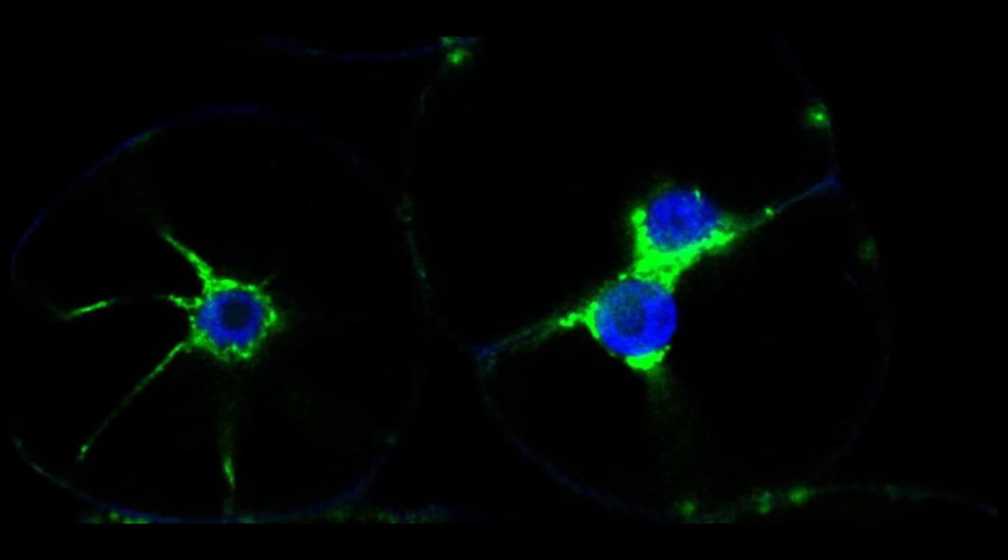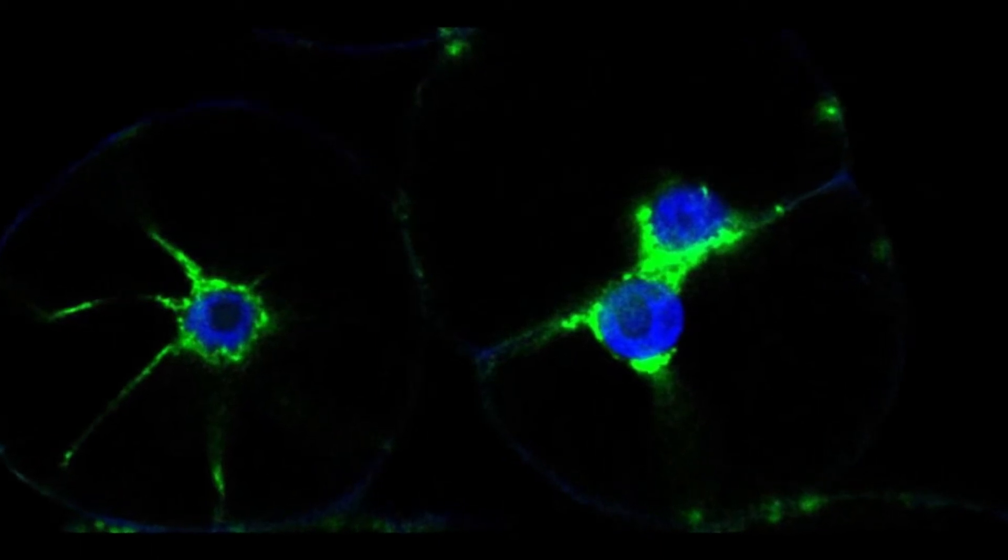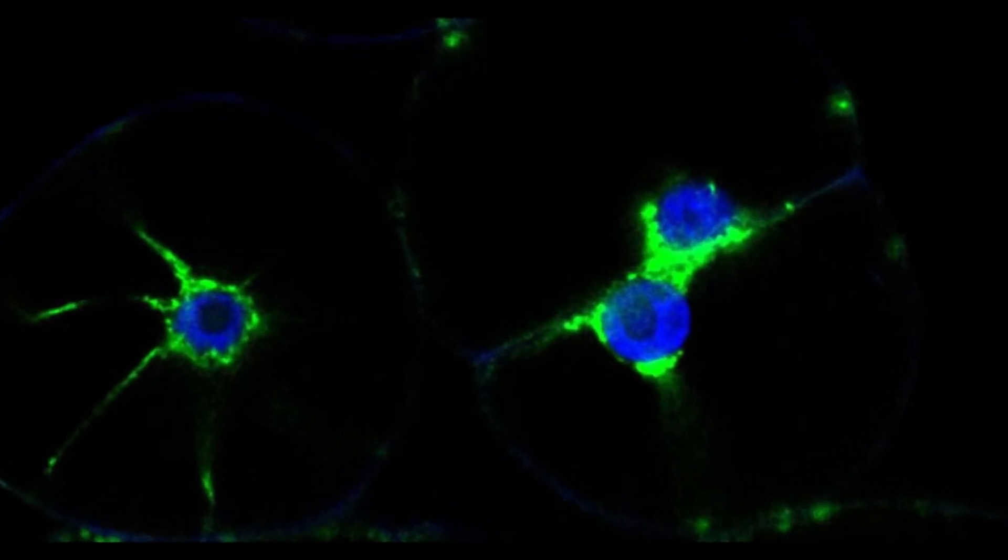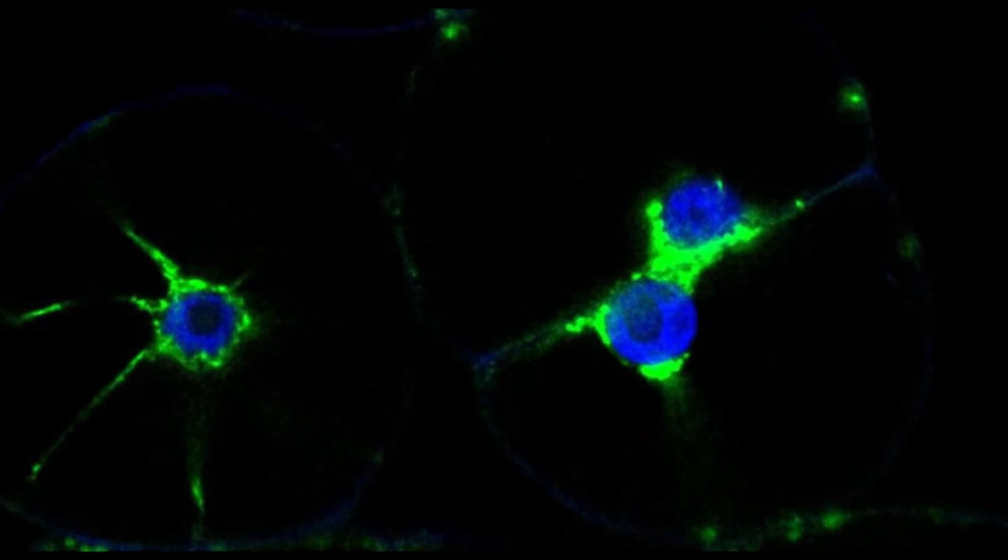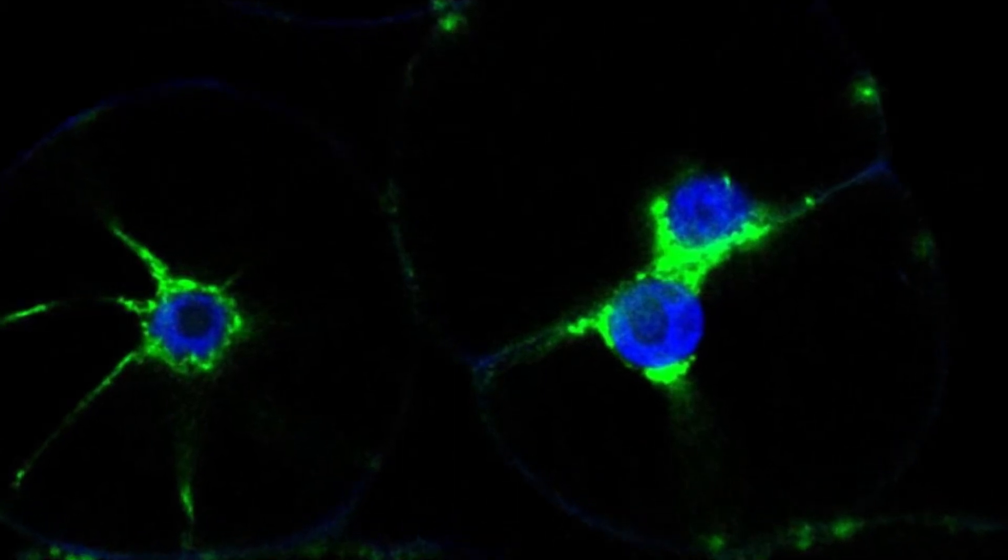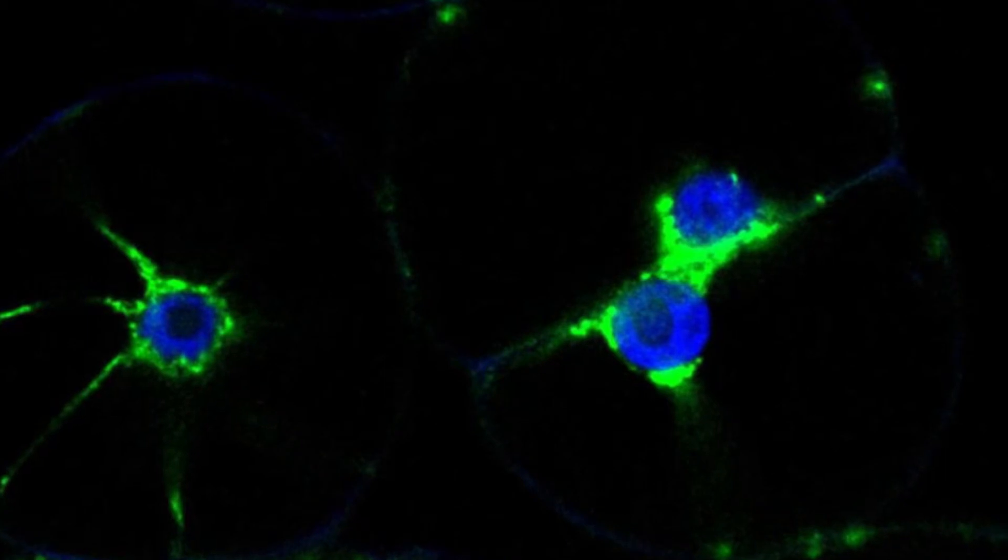Here is an image of tobacco cells. Plastids are labeled with green fluorescent protein, or GFP, and the nuclear DNA is labeled with DAPI. The plastids are shown surrounding the nucleus.